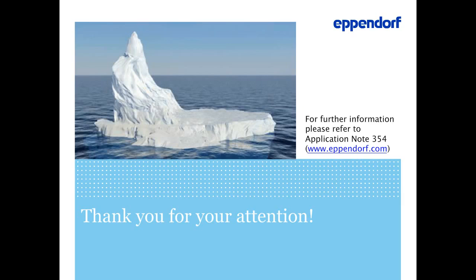Yeah, thanks for this question. Let this answer be a little bit longer since you asked for the details. First of all, you should define the accuracy and requirement of your pipette. If you are using it only for aspirating supernatants, there might be no requirements in terms of inaccuracy and precision. In contrast, if you are using the pipette for quality defining steps, you should define the performance of the system.